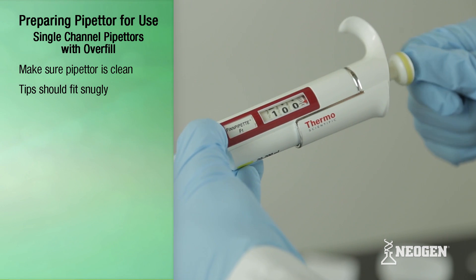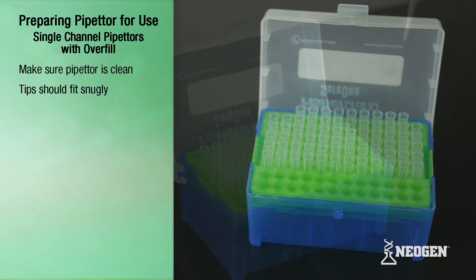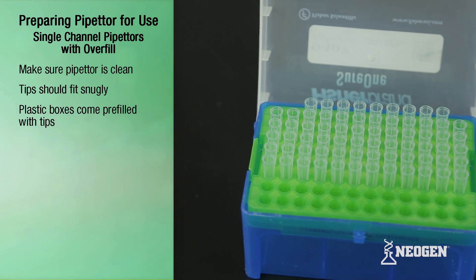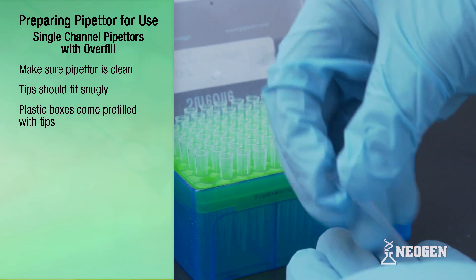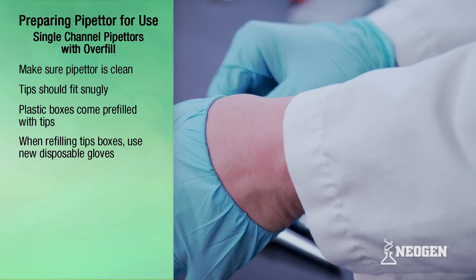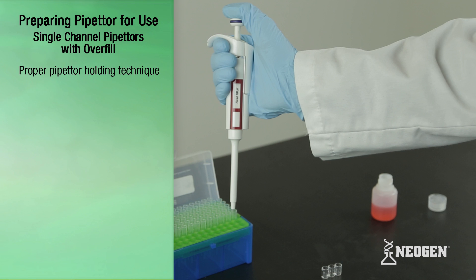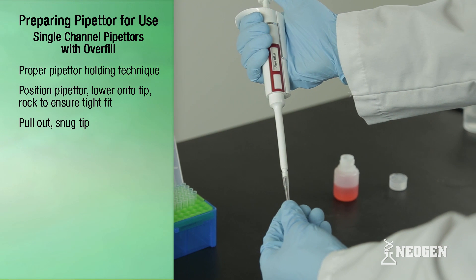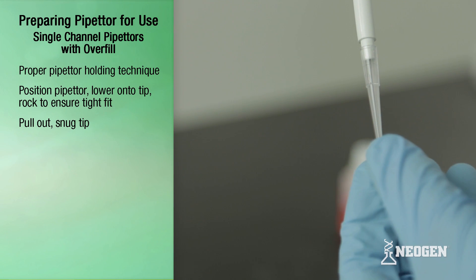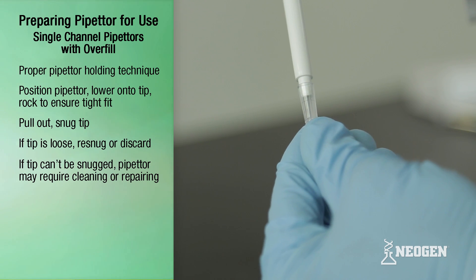Once the correct pipetter and volume is selected and functionality is verified, the pipetter is ready for use. The first step is to attach a plastic tip to the end of the pipetter. Neogen recommends using plastic tip boxes instead of attaching them by hand. When refilling tip boxes from bags of tips, be sure to wear new disposable gloves. Attach a tip by holding the pipetter with your thumb on top and the finger hold facing outward, then lower the pipetter down into the tip. After attaching, pull the pipetter out and snug the tip by pushing the upper part onto the nozzle by hand. If a tip is loose, re-snug or discard it and attach a new tip. If a tip can't be snugged, the pipetter may need to be cleaned and repaired.